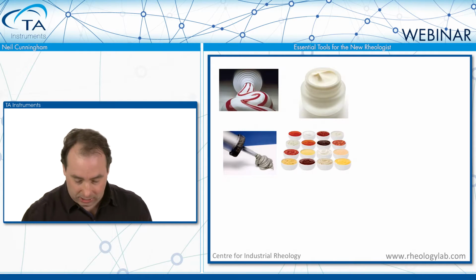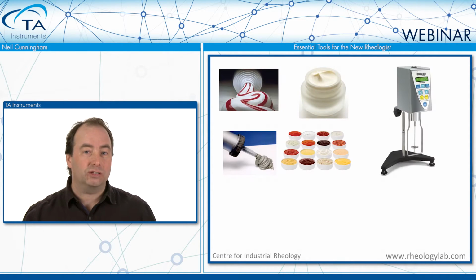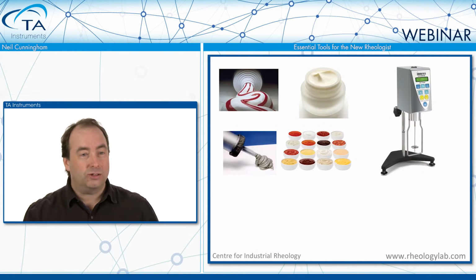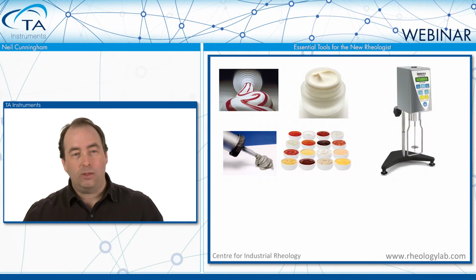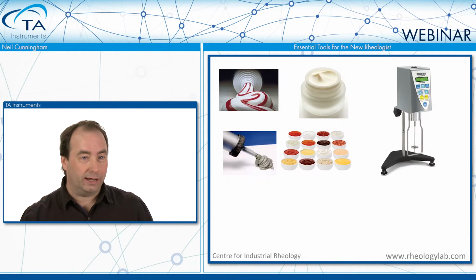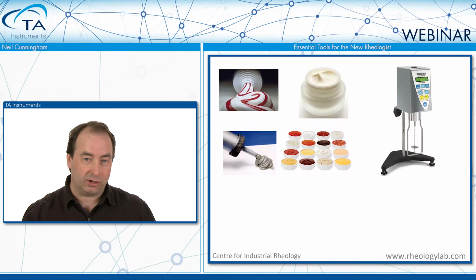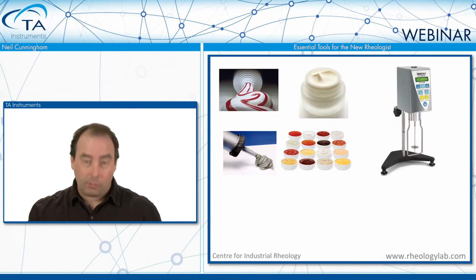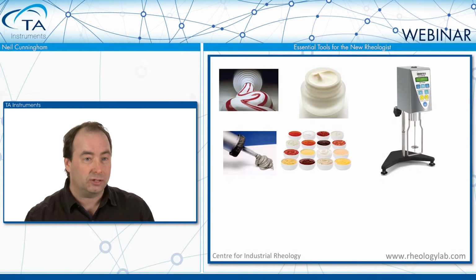Typically, when they come to us, up until that point, they've just been using some simple viscometers, much like this Brookfield type instrument here. These are simple, easy to use, low cost, and they're everywhere. You can find them in all labs. The way these instruments work is that you select a spindle and a speed, and you immerse the spindle into the sample and start the instrument running, and you'll take a viscosity value off the screen. So this is what we call a single point test. A single point test is typically the way that these instruments are used.